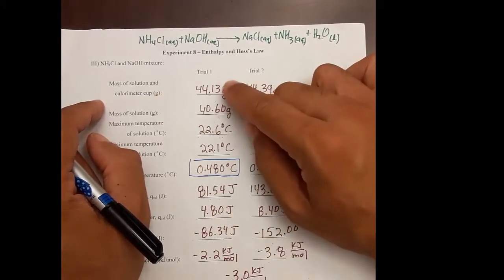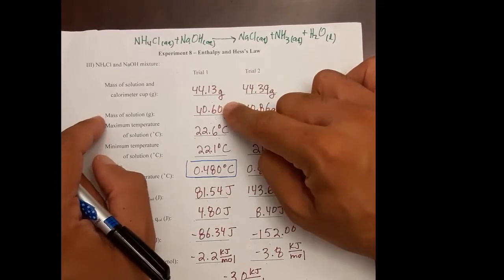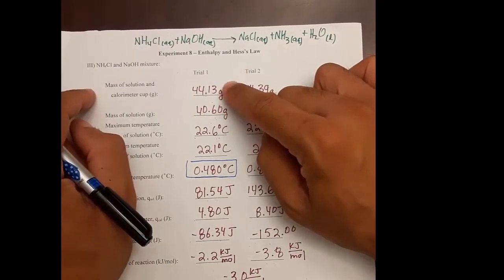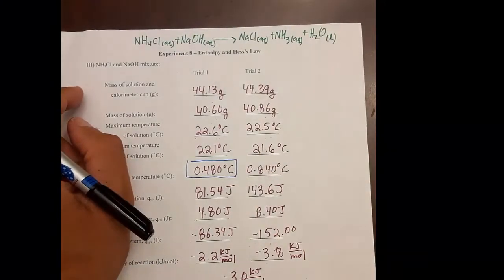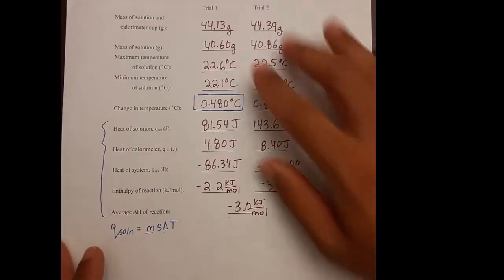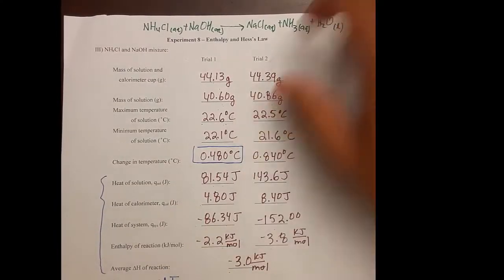Doing that, I get a mass of the solution of about 40.60 grams.